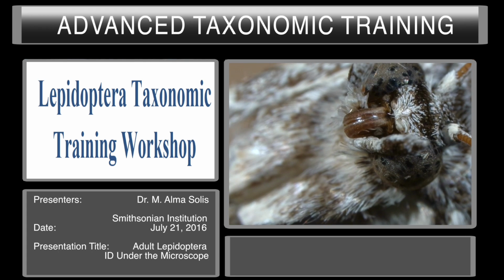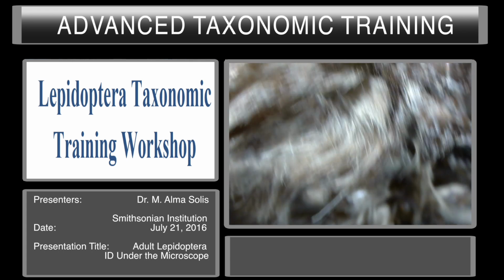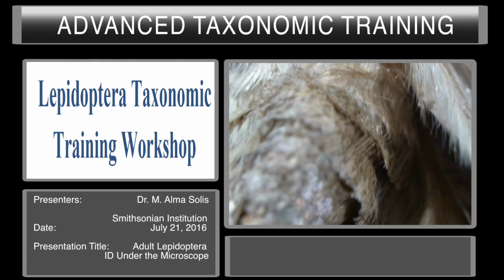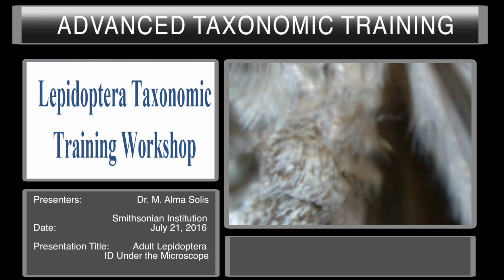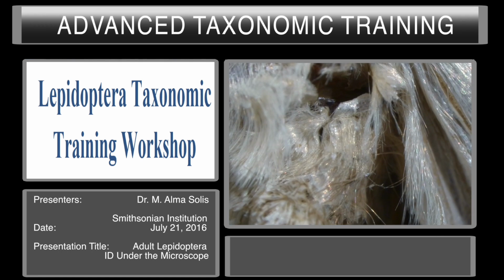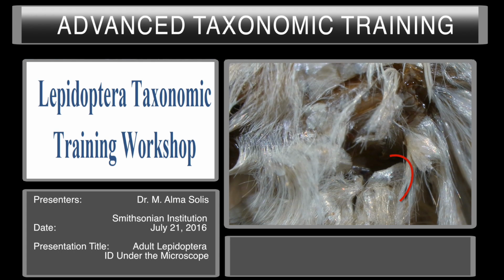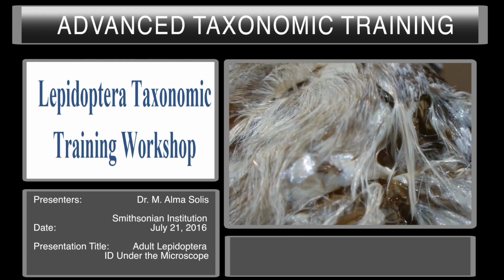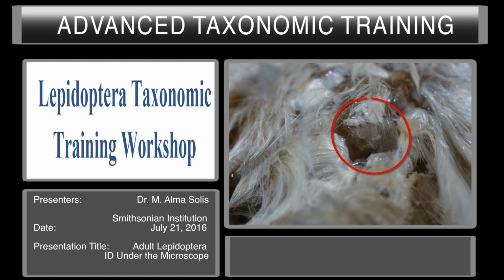So we have the noctuid. This is a beautifully cleaned moth. You can see there are no scales. It's very, very smooth. And then you will look laterally between the metathorax and the abdomen. I look at it usually sideways, and you can see that there is a very complicated tympanal organ right in here. See this little hood on the abdomen, and then if you turn the moth just slightly so you're looking at it like this, you can see the more complicated thoracic part of the tympanal organ.